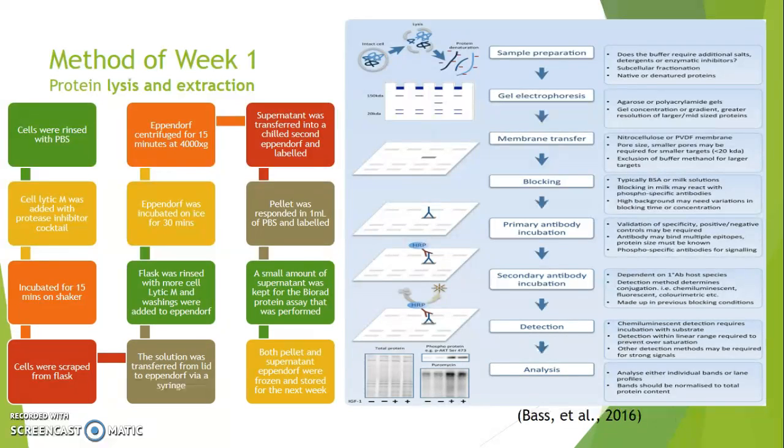The normalization of protein content is carried out to account for differences arising from cell culture conditions during extraction and inconsistent sample preparation amongst everybody in the groups. Therefore, it ensures that the same concentration of a particular cell line's protein is loaded. If normalization is not performed, then inconsistent amounts of protein will be loaded onto the gels.